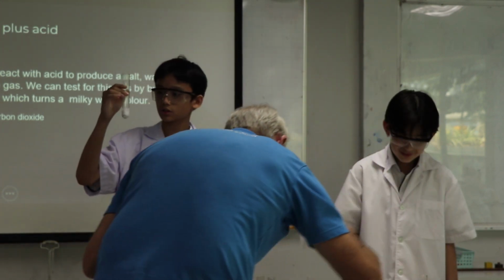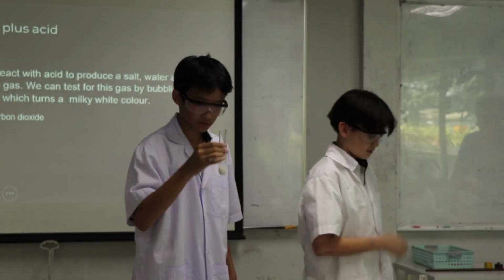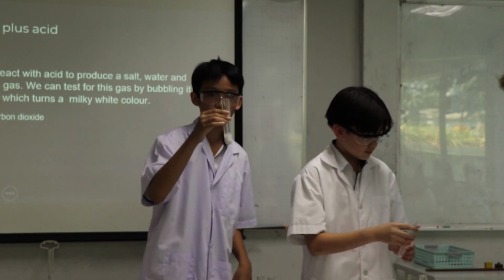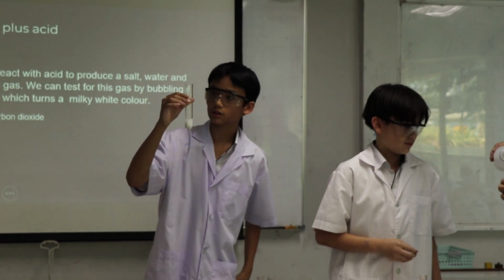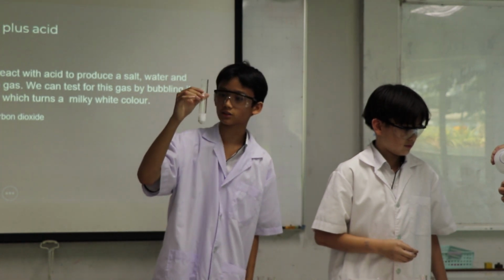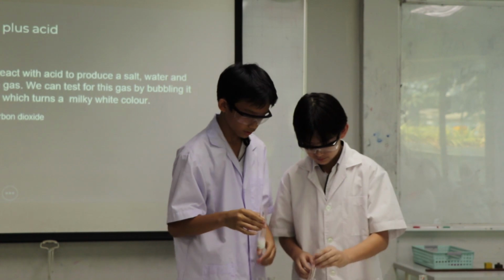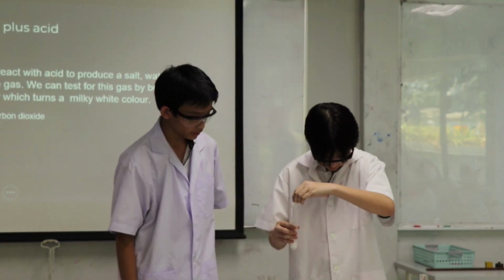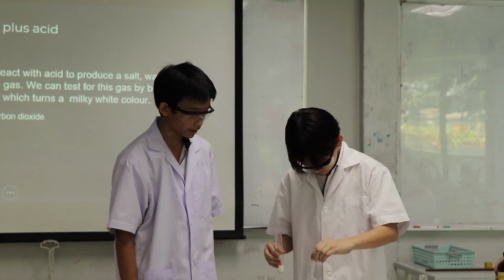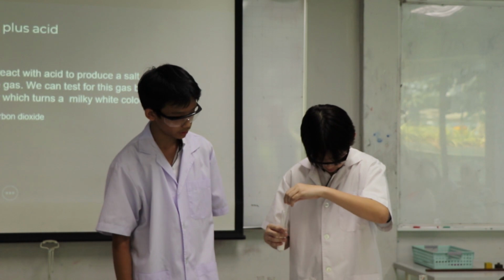This chemical reaction produces carbon dioxide, which is floating above it, and the carbon dioxide actually doesn't go out of this boiling tube because since it is a high density gas, it will be stuck in here, it will stay down there. Now Romeo will be grabbing that carbon dioxide that is stuck down there, placing it into lime water, which will cause another reaction.